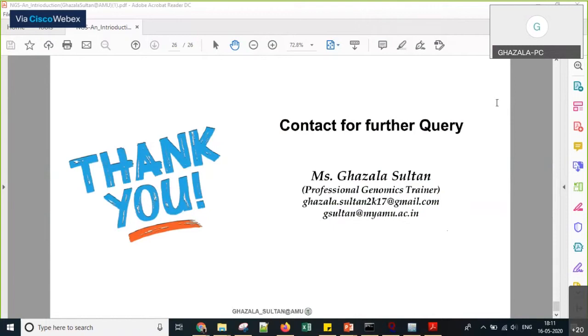Okay, so generally we talk about single end sequencing and paired end sequencing. That difference you might know, because you have the advanced question. And mate paired sequencing might be... okay, probably I need to check on this, because mate paired sequencing are in pair. For example, if you have two sequences of the same length and same number of nucleotides, probably that is the mate paired sequencing. I will check and confirm on it, and then we'll let you know.